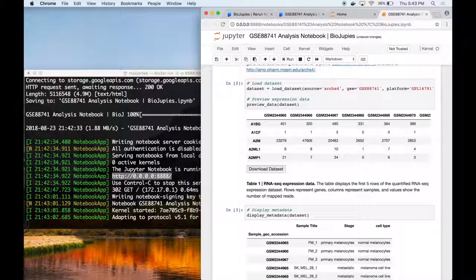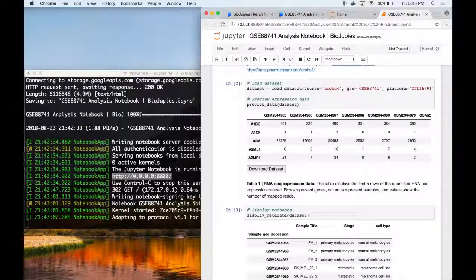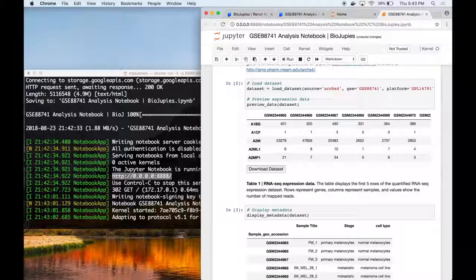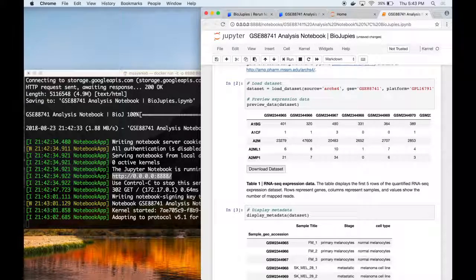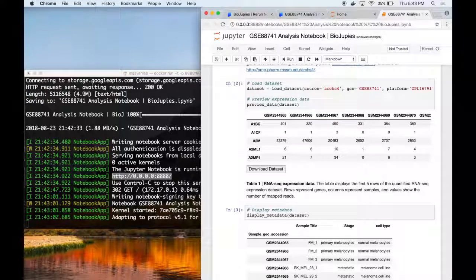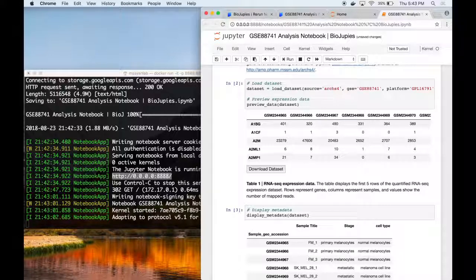If you wish to access the notebook again in the future, you can launch the same Docker container without providing any notebook identifier. This way, the container will launch your Jupyter server without downloading any new notebook.